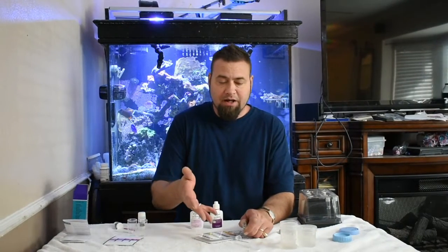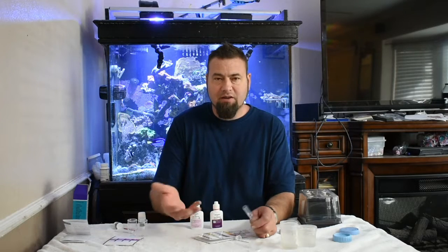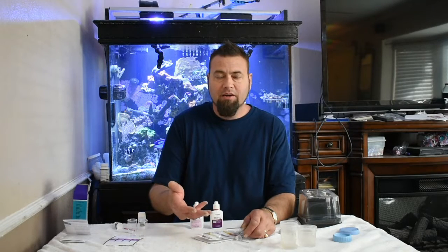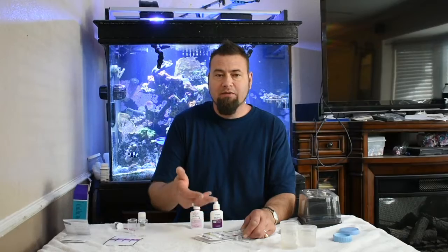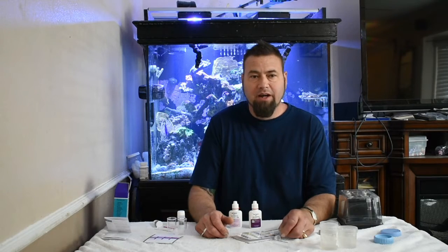The API test kit — you're spending around maybe ten dollars or so for the nitrate test kit. If you wanted to get the whole master test kit, then you're about twenty-five dollars, something like that.